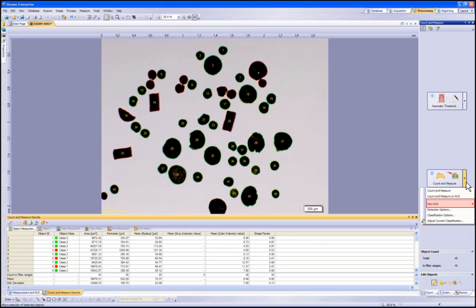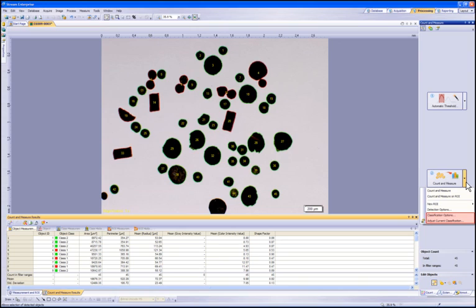Detection options allows you to change the settings such as counting border particles and how to color code particles. You can also choose options for your classifications from here or make adjustments to your current classifications. Let's click out of this and continue with our inspection.